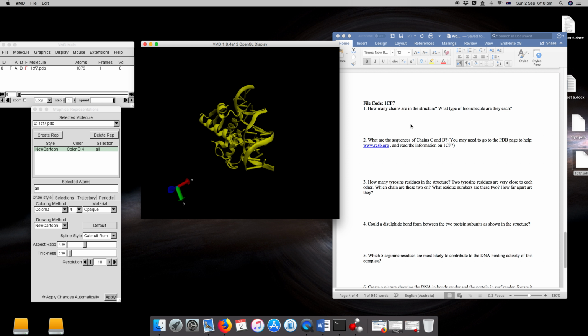Okay. So when it asks us in question one, how many chains are in the structure? What type of biomolecules are they each?